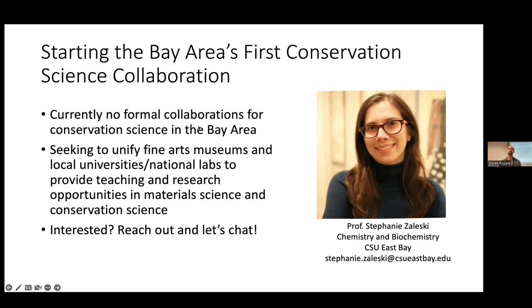Yeah. So I'm excited about the talk. I'm excited about the kind of sampling parameters for some of these, so you're talking about paint chips, for example. What other types of materials does 4D-STEM provide? For example, if I'm interested in the way that stone is damaged by wildfire, and I want to quantify that potential structural change from that exposure to heat, is that the kind of thing that a sample of a bedrock mortar, sent to you as a tiny little chip, could be evaluated through 4D-STEM? Because I know how to do that with XRD, but I don't know how to do it with 4D-STEM. And I'm curious, what would be the better quantification of the amount of damage to such a thing through something like this?